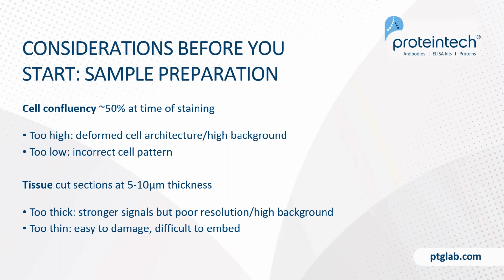If your tissue is too thin, then it will become easy to damage and also could be difficult to embed, resulting in, again, poor staining.